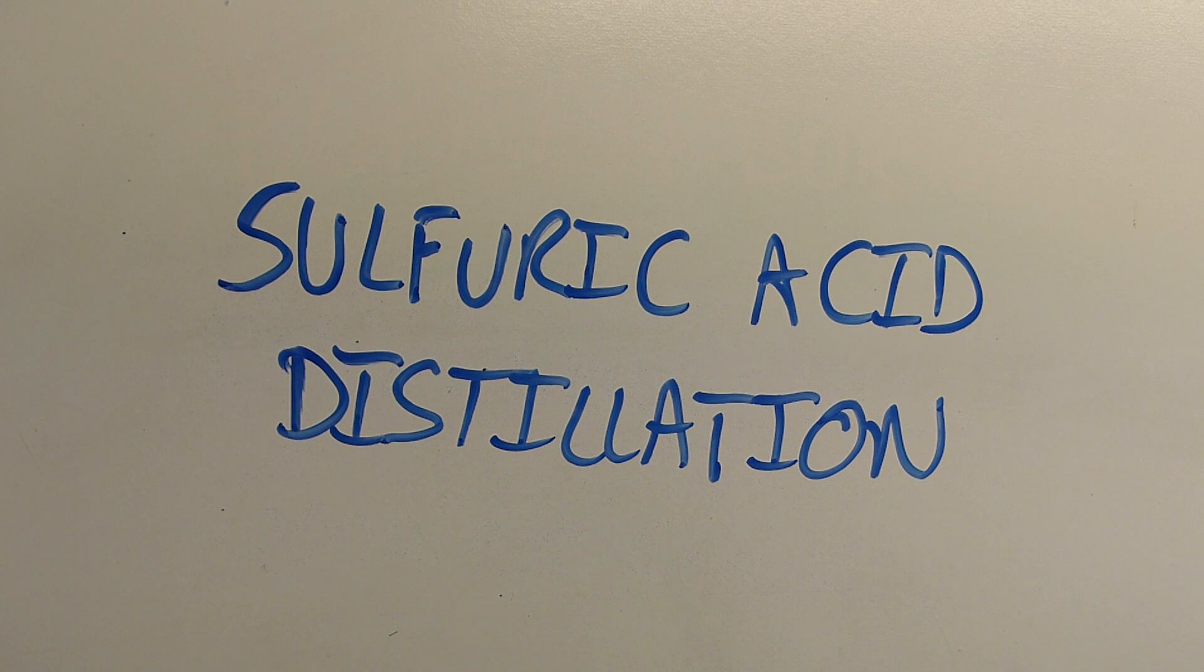Now drain cleaner acid starts at around 92-93% based on my own titration. The MSDS typically says 93%. So the sulfuric acid can be distilled to its azeotrope of 98% by simply heating, and at first water will start to distill over and then the sulfuric acid will distill over.